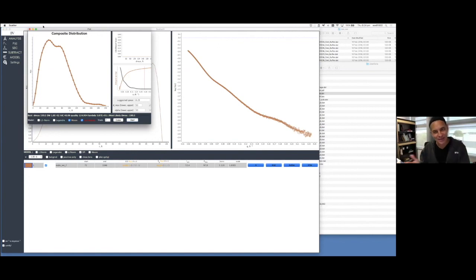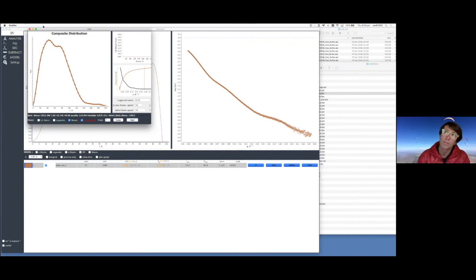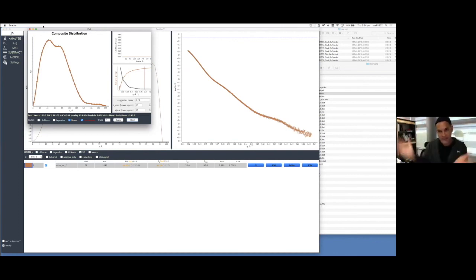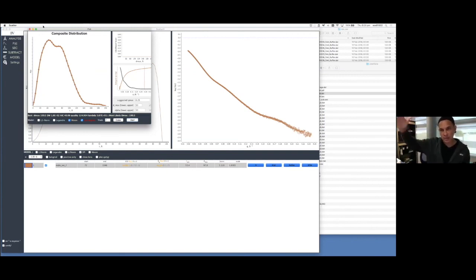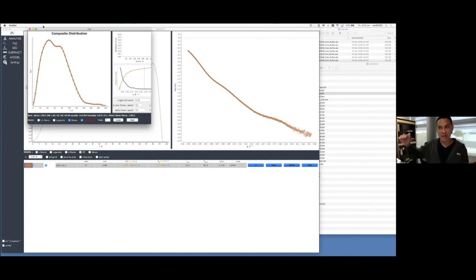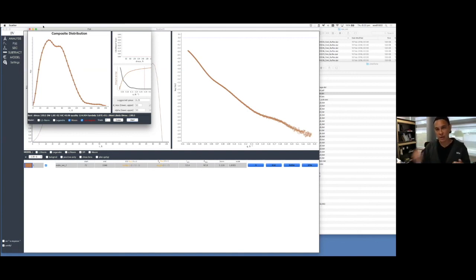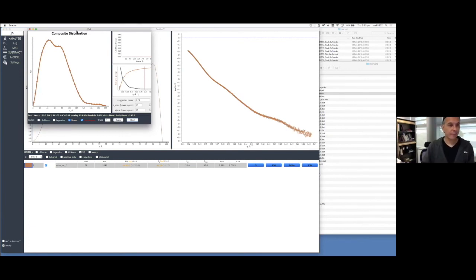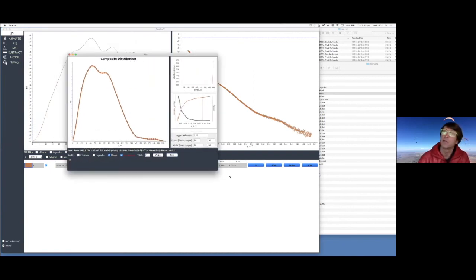What matters is looking at the Porod-Debye exponent. As something moves from compact and globular at 4, to elongated like the lysine riboswitch, the exponent moves down to about 3.2 to 3.4. I haven't seen a really stiff rod with a Porod exponent less than 3. So if you're under 3 and the normalized Kratky shows no peak, it's likely unfolded. You want to look at both the normalized Kratky plot and the Porod-Debye exponent together.